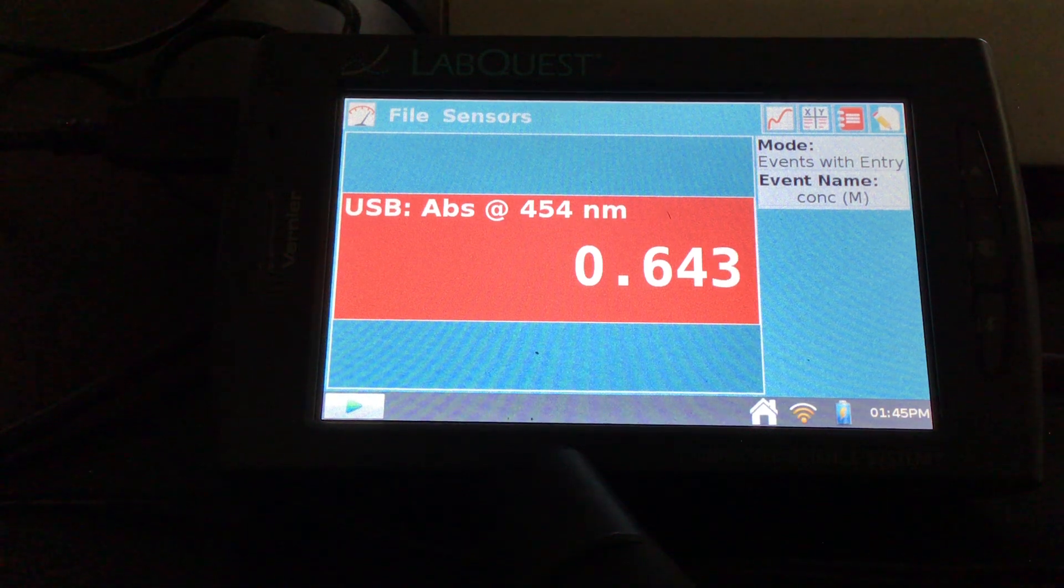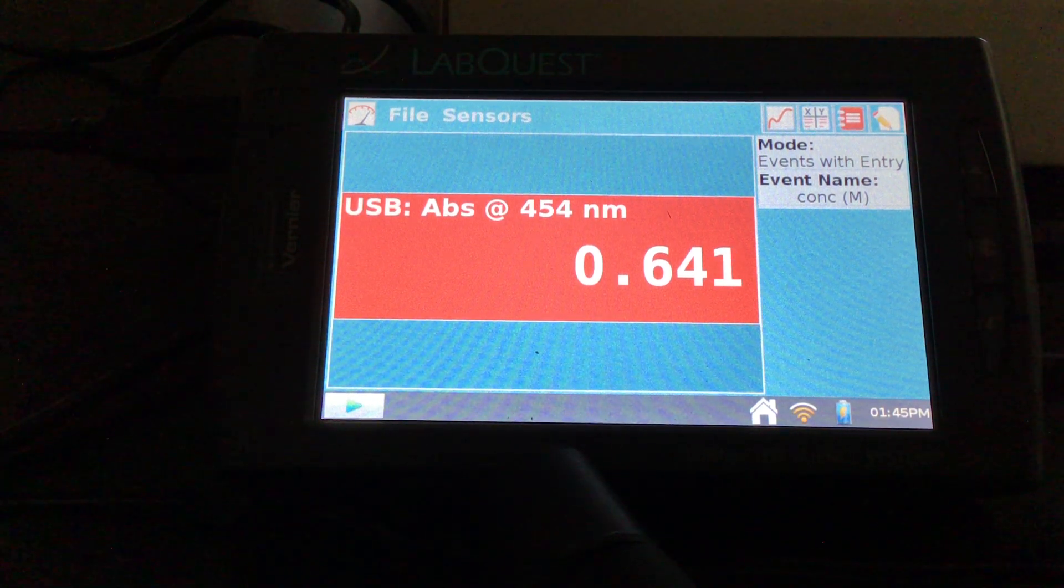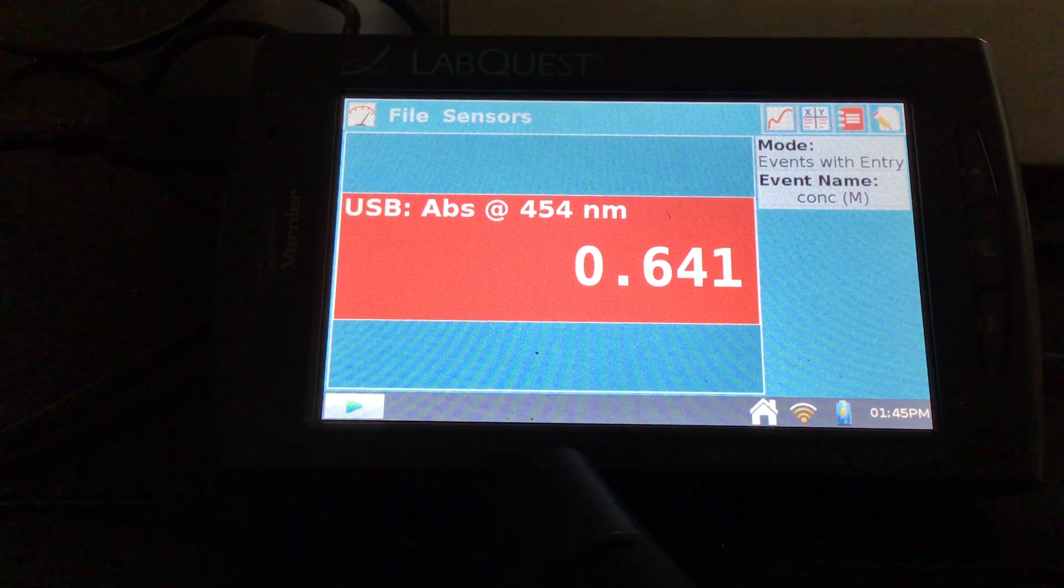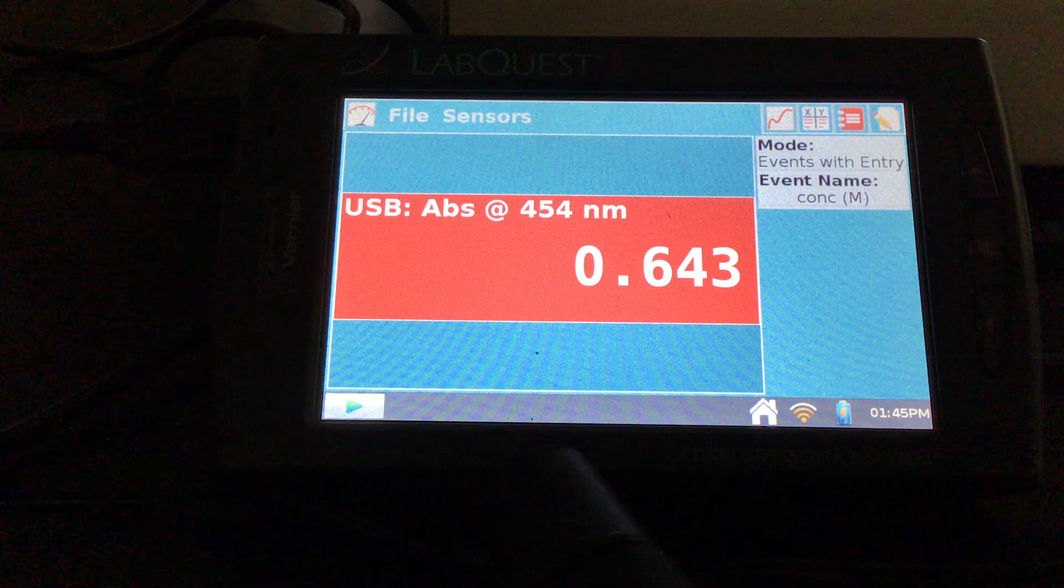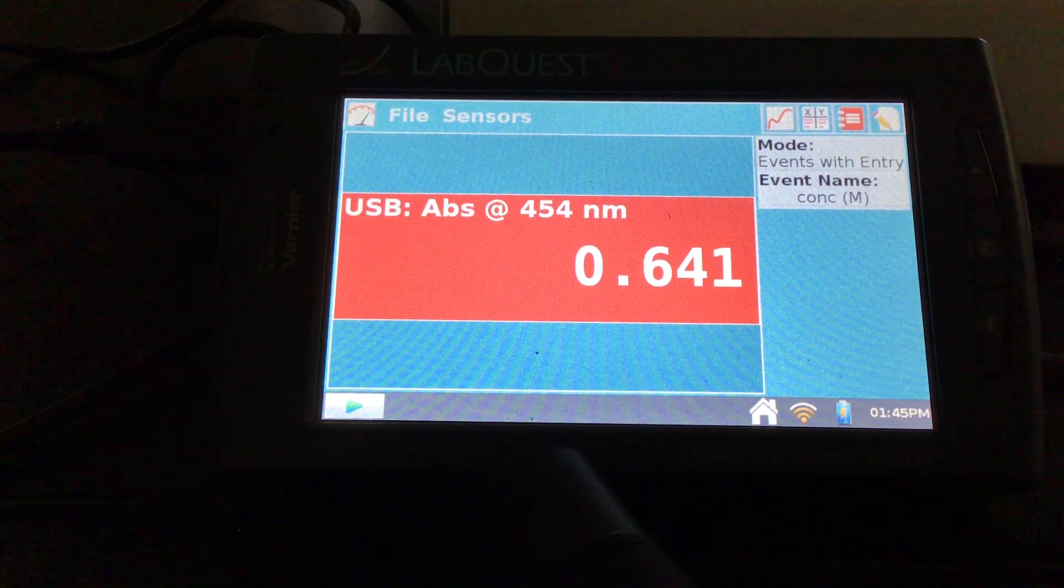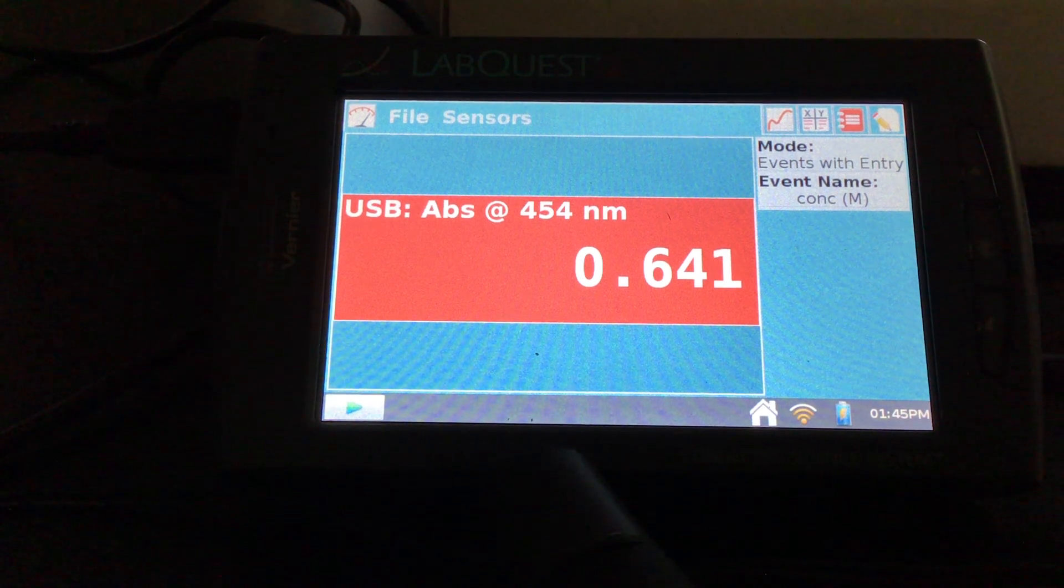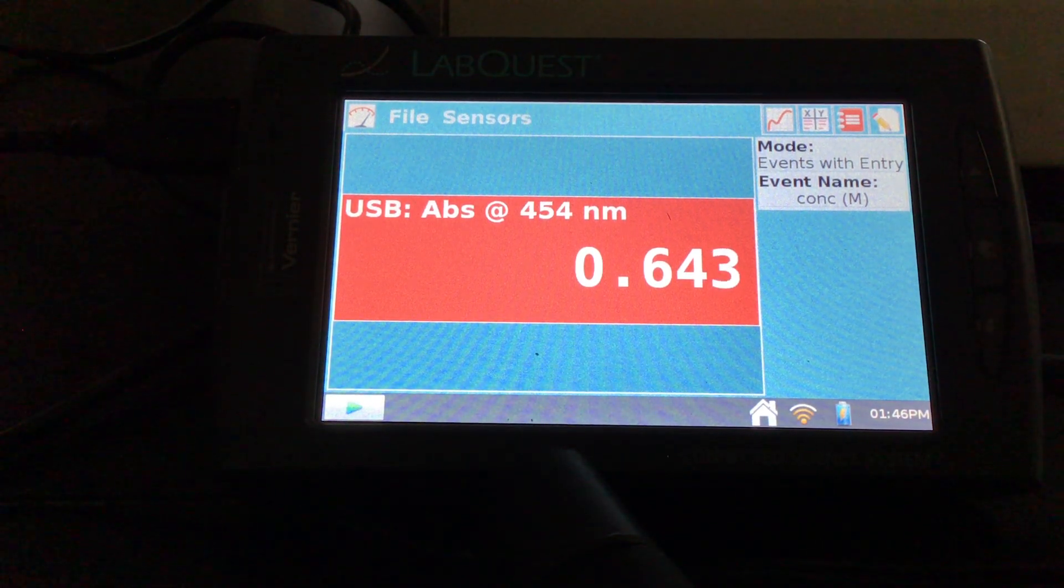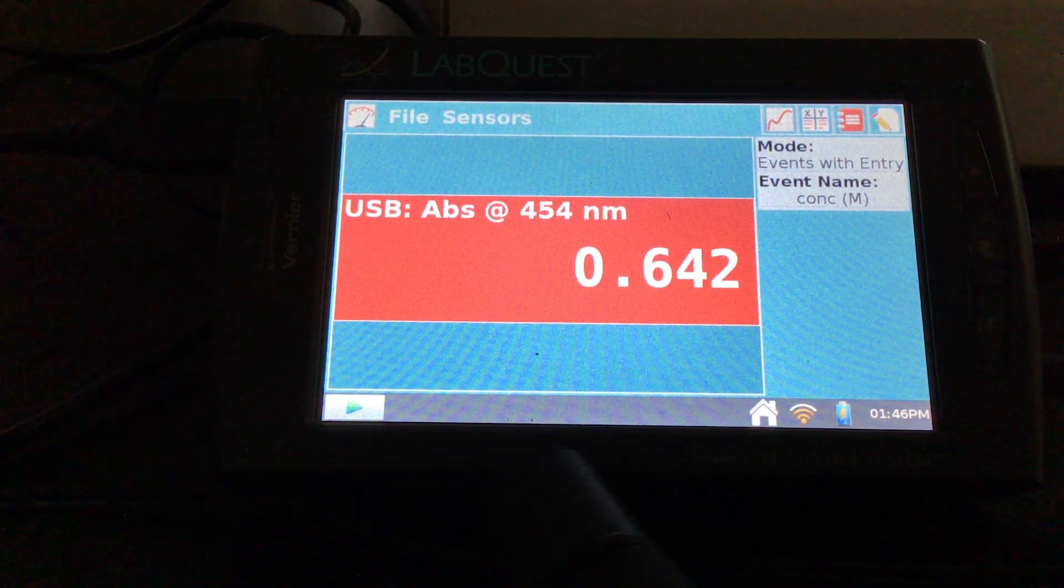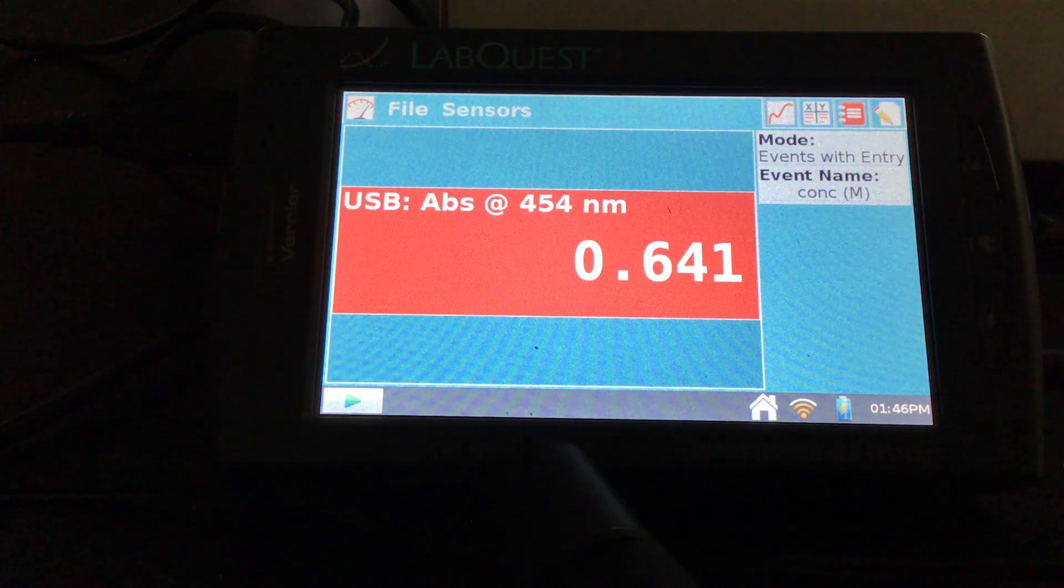And I added in this case, five milliliters of the 0.002 molar thiocyanate solution. Then I mixed the five milliliters of the iron nitrate with four, three, two, and one for my other standards. So you want to be able to calculate your concentrations of these prior to this mode because what you want to do, you want to be able to enter the concentrations into the SpectraViz.